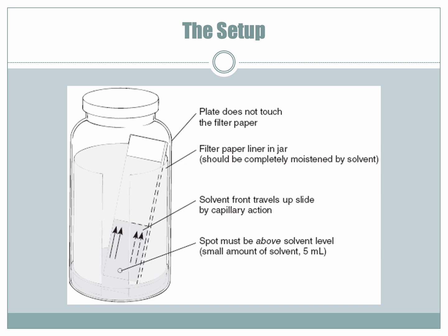And then you'll watch the surface of the liquid. You'll watch the solvent front. That's the line where the liquid is. And when that solvent front reaches the line at the top of the card that you drew, then you remove the plate and you're done developing.